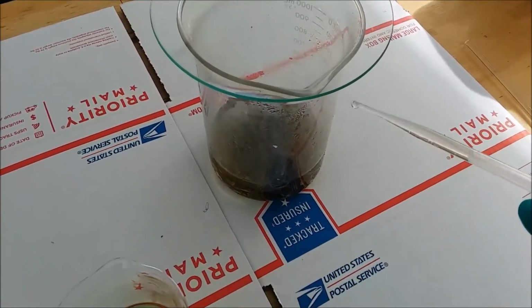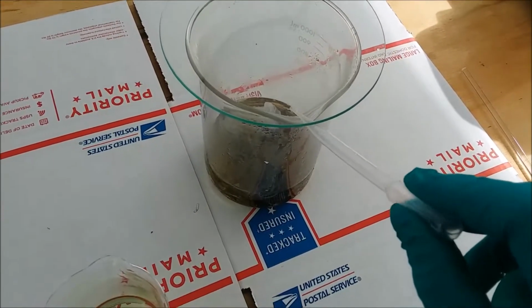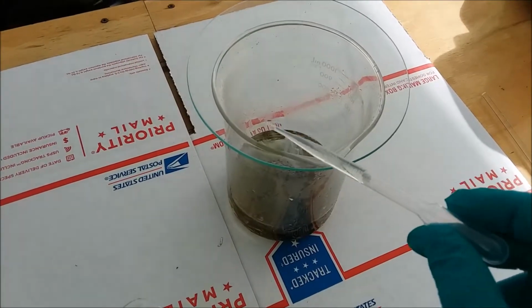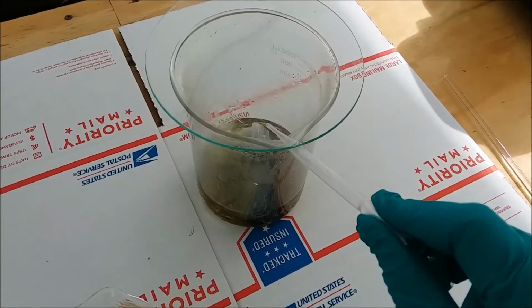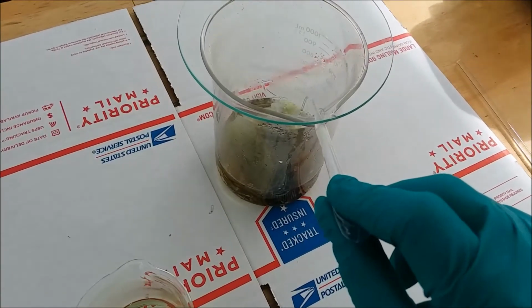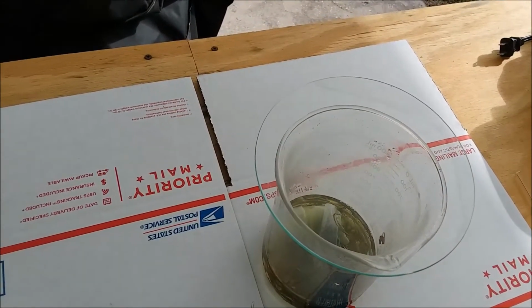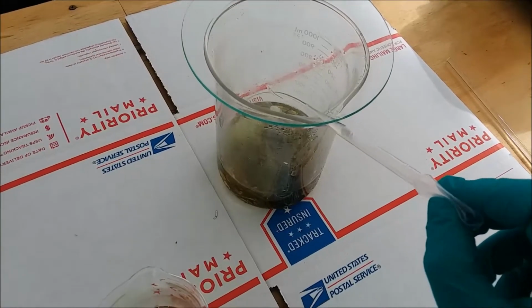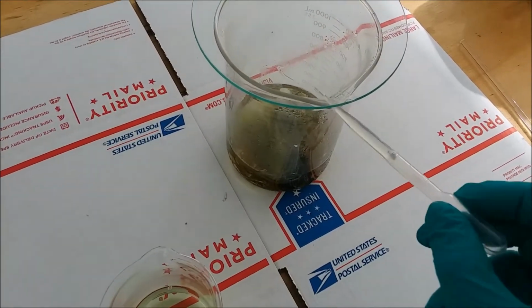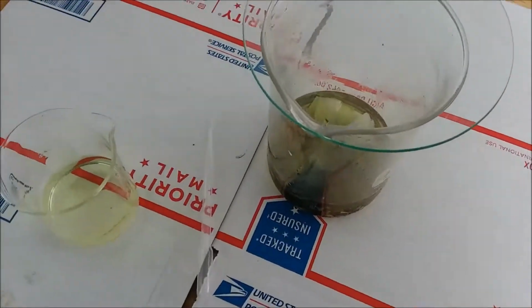I'm going to start adding pipettes full of the liquid chlorinating stuff, the bleach. You get an immediate fizzy reaction when the bleach hits the muriatic acid, and that's chlorine being produced. There's 3. I'm getting about 2 milliliters per pipette full here, so that's 4. Alright, that's 5. So that's about 10 milliliters total of bleach so far.